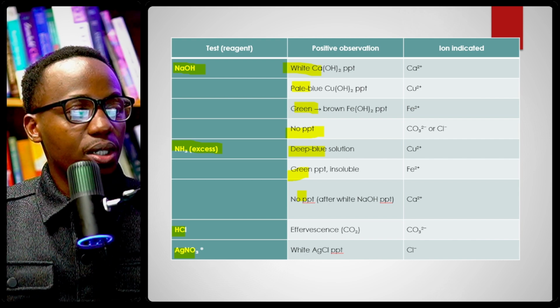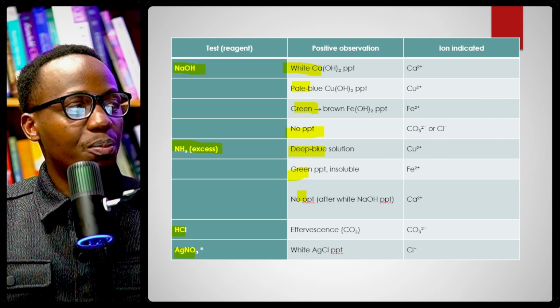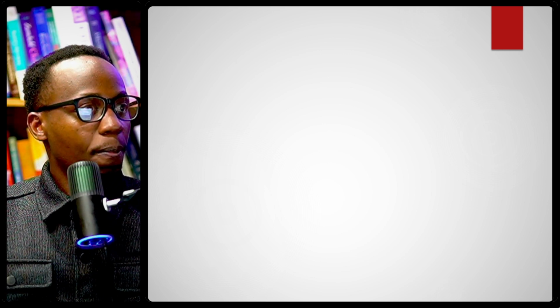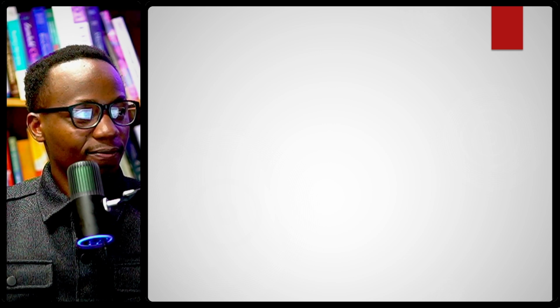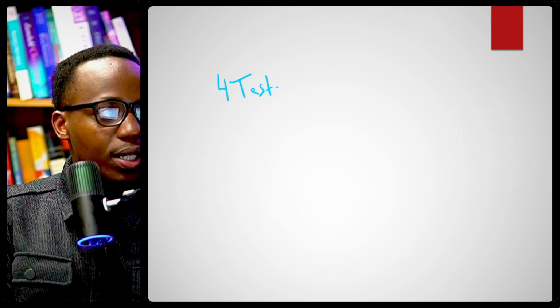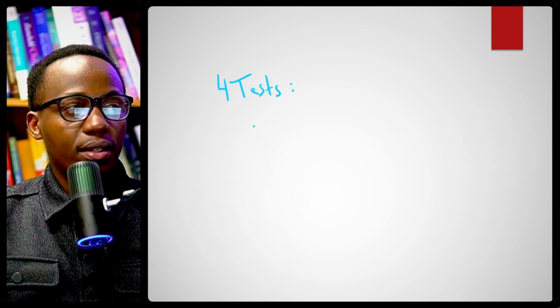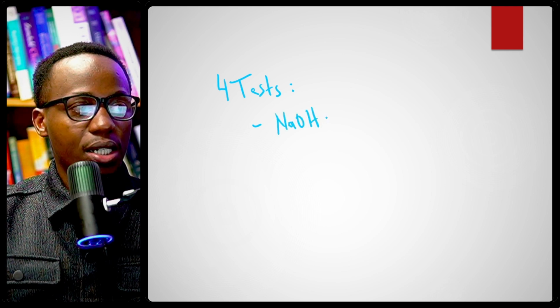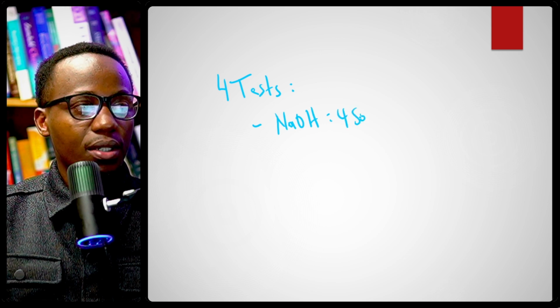So we're going to have to put it all together. To put it all together, you are going to have 4 tests, all qualitative, right? The first one is NaOH, which will be 4 samples.